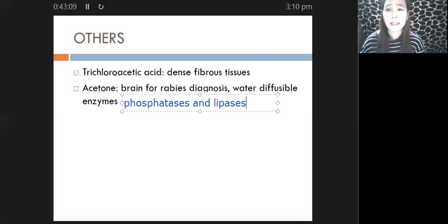Like for example, in the case of water, water evaporates at 100 degrees Celsius, right? Okay. And so, room temperature is a low temperature if we are going to consider the evaporation of your substances. Okay? So your acetone, since it is a very volatile substance, how are you going to maintain it at a liquid state if you are going to make use of your acetone at room temperature, for example?